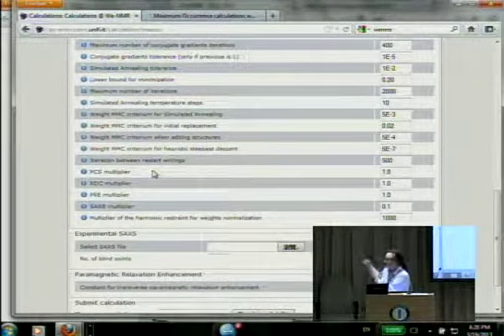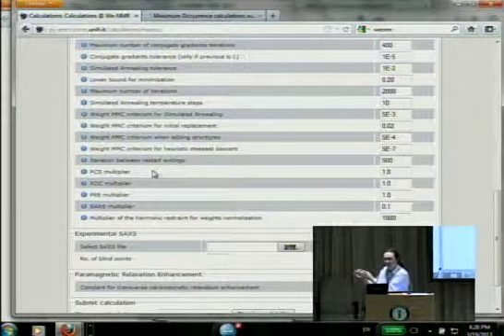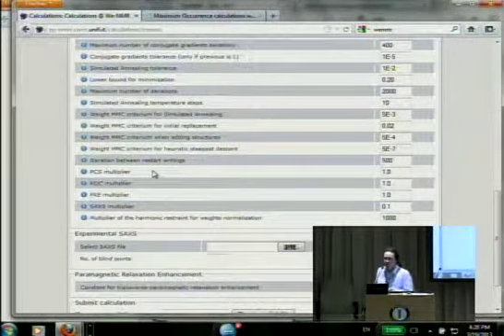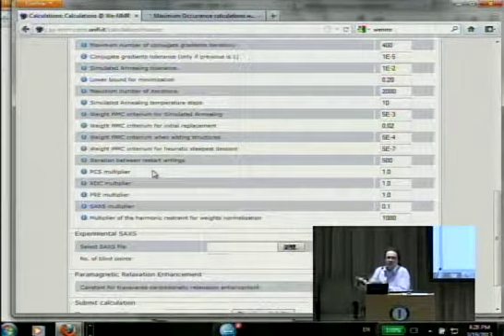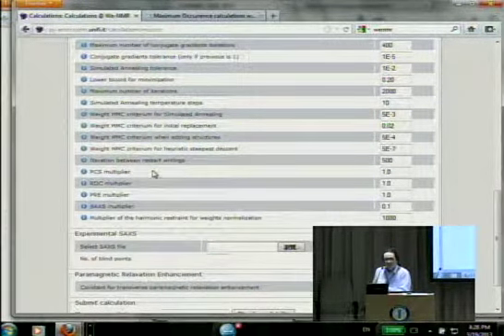Well, if you go into the output files that are produced at the end, you get the residuals from both data sets. So you see if one is having much more violations than the other, then you just reduce its weight, more or less. That's proportional.